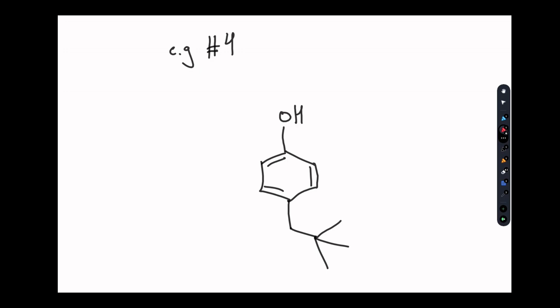So just like we saw before with that last hydroxyl group, this hydrogen here is clearly unique, and we would expect to see an integration 1 signal representing it. However, on the benzene, we have 4 different hydrogens.